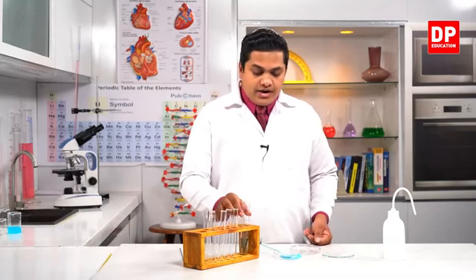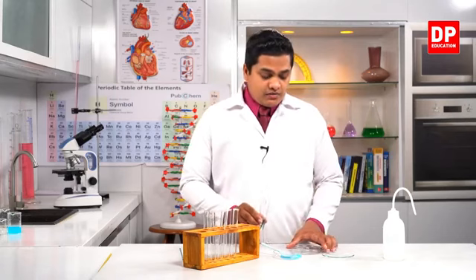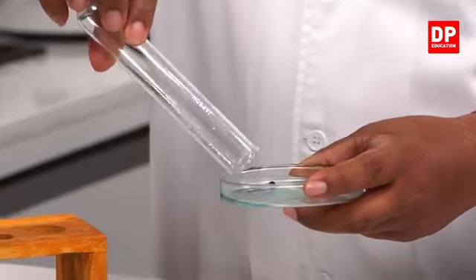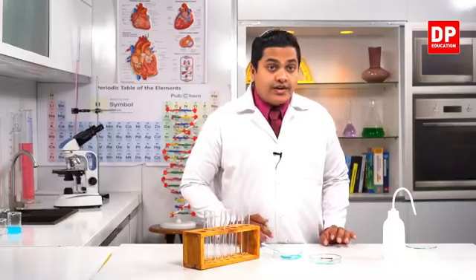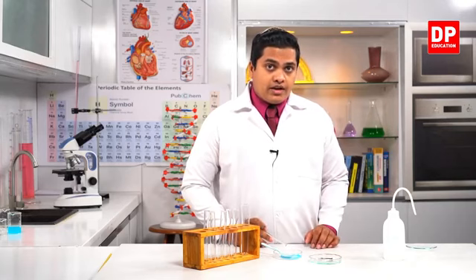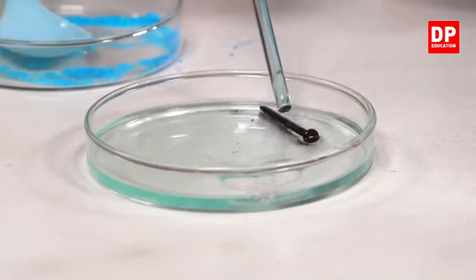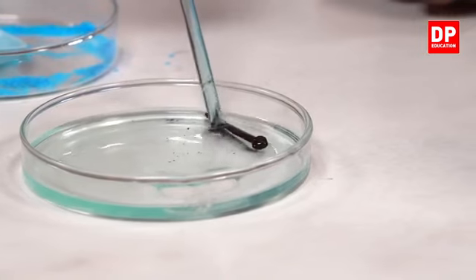And now we'll take the iron nail out and we'll see whether we can observe any change in the iron nail. So I'm going to pour out the water. Right, let's see whether there is any change in the iron nail. In the earlier case, my dear children, this iron nail was a very clean iron nail. There wasn't any substance. Now here you can observe, when I scratch this with this glass rod, we can see there is some substance. This substance is like a powder.